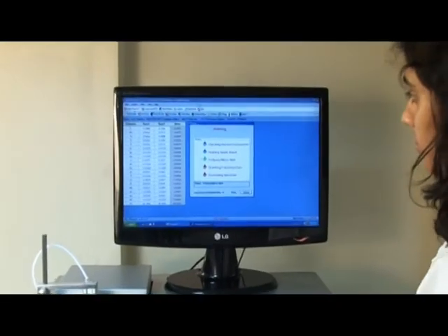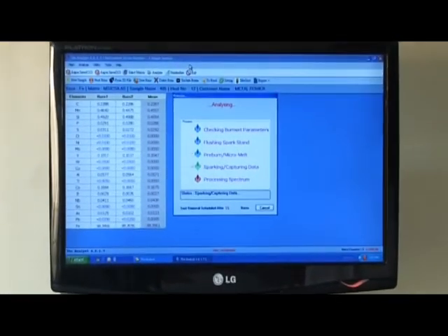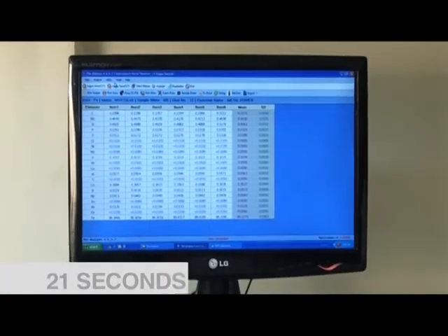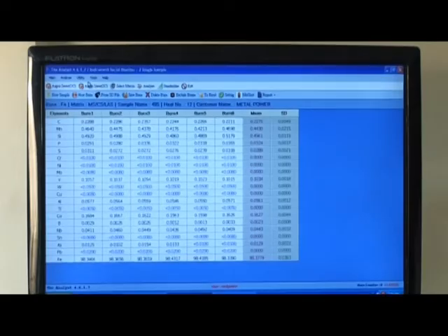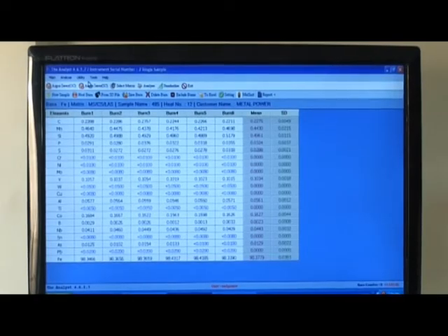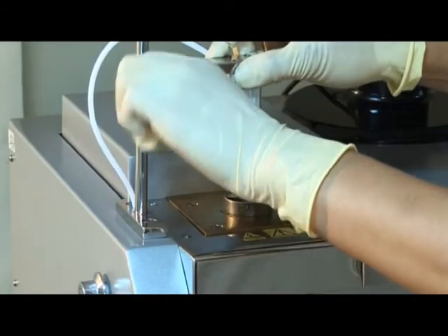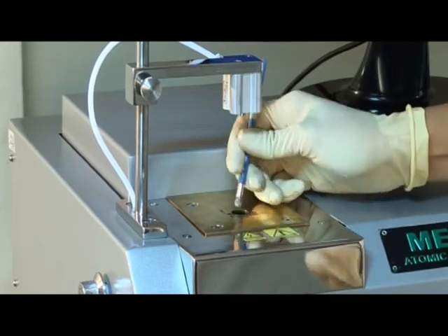The progress of the analysis can be seen on the screen for reference. Ferrous analysis is completed in 21 seconds. The analysis results are automatically displayed on the PC screen. The sample position is shifted to analyze a fresh spot.